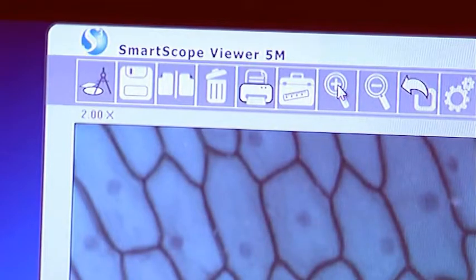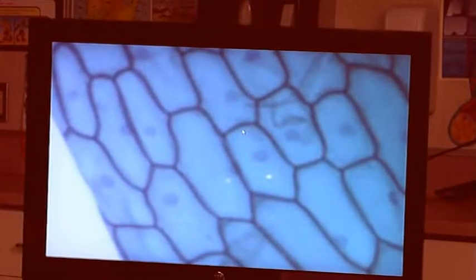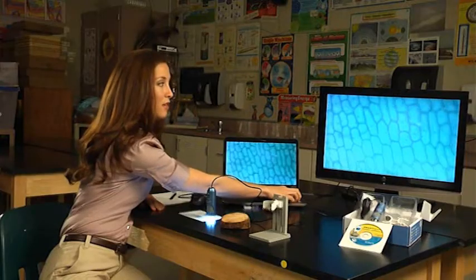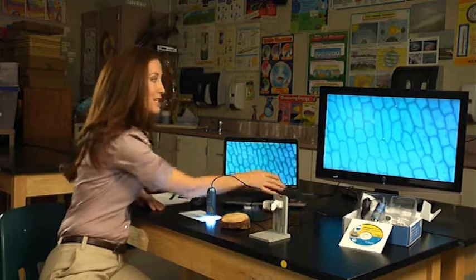So you can zoom in. You can go back into full screen mode. And you can even use the arrow keys to move around the picture. So you've got a lot that you can really zoom in and see here with the SmartScope 5M.